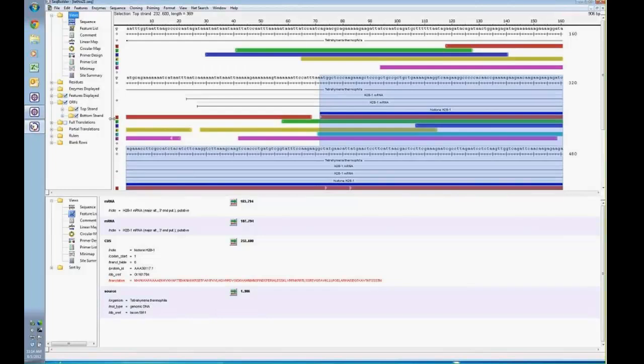So the one frame is basically the frame that doesn't cause the target that's highlighted to shift. The two, what we know as green here, would be the +1 shift, and the purple would be the +2 shift. So if it causes it to shift 2 base pairs, obviously that's going to affect your translation when you eventually try to express this target of interest.